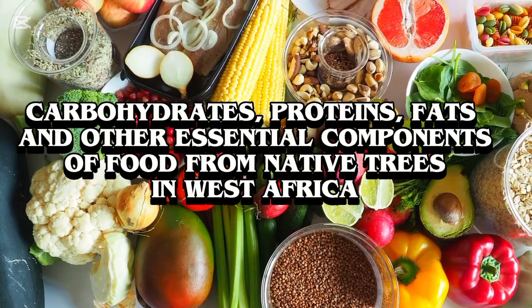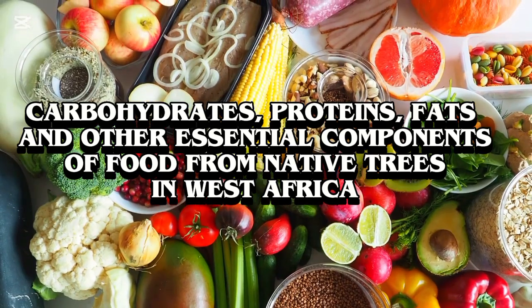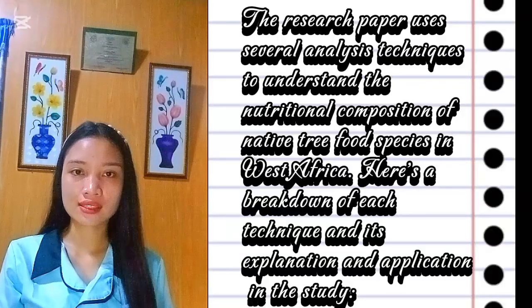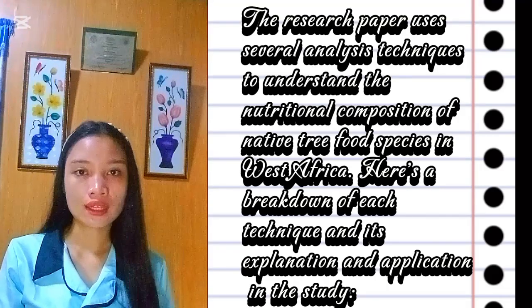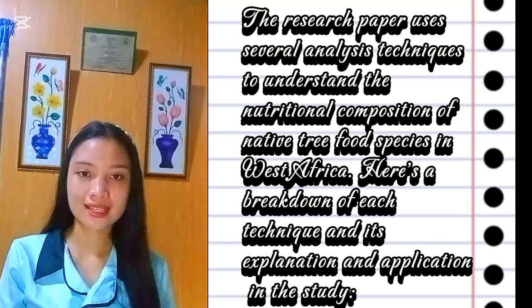Carbohydrates, proteins, fats, and other essential components of food from native trees in West Africa. The research paper uses several analysis techniques to understand the nutritional composition of native tree food species in West Africa. Here's the breakdown of each technique and its explanation and application in the study.